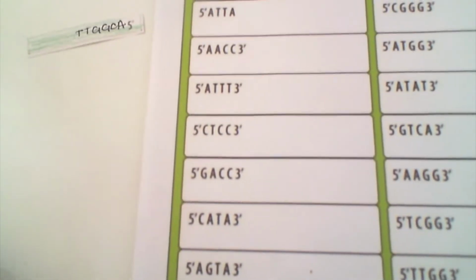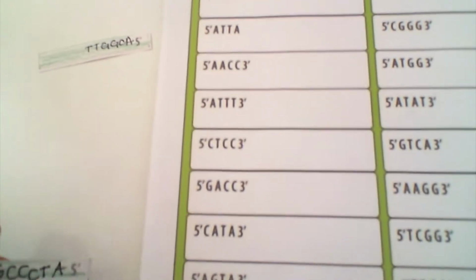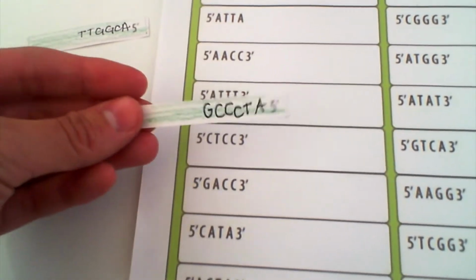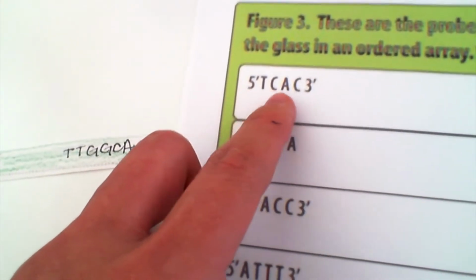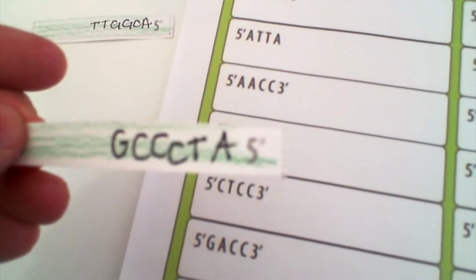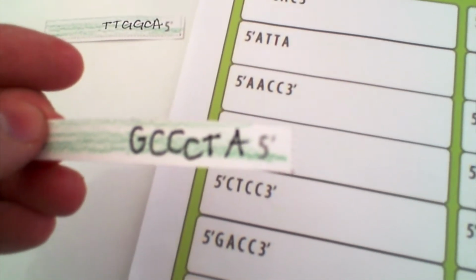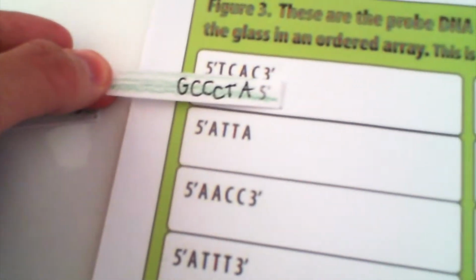Okay, I'm going to show you how this is done because I believe the virtual lab does not show it as well as I would like it. So we have a normal plant that's given sun. This is the cDNA. Now on the microarray, you notice that the complementary strand is a whole lot shorter and it's only 4 bases long. Meaning that the cDNA, even though it is about 6 base pairs long, only 4 of these bases need to match perfectly to what's found on the microarray.